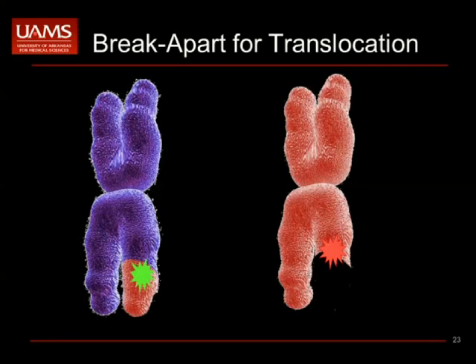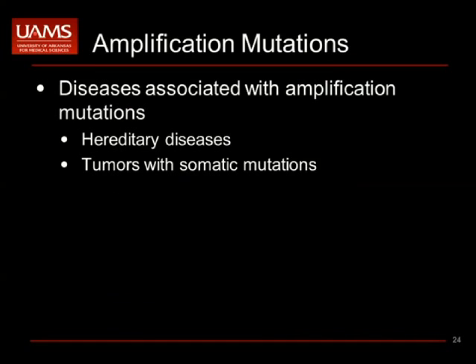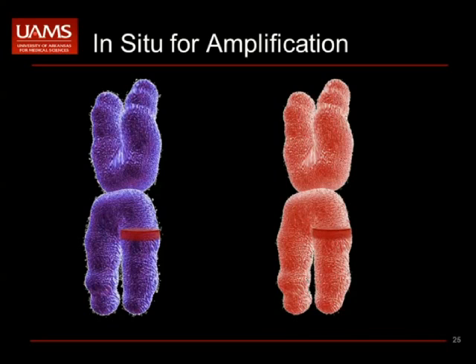So going back to the fundamentals of what kind of DNA we can get out of these samples, you recognize that using a PCR across these very large areas is going to be nearly impossible from paraffin-embedded samples. So if you look at the gene 1 and gene 2 next to each other at the DNA level, you will have a very large area of DNA between here, and amplification will be nearly impossible across that area.